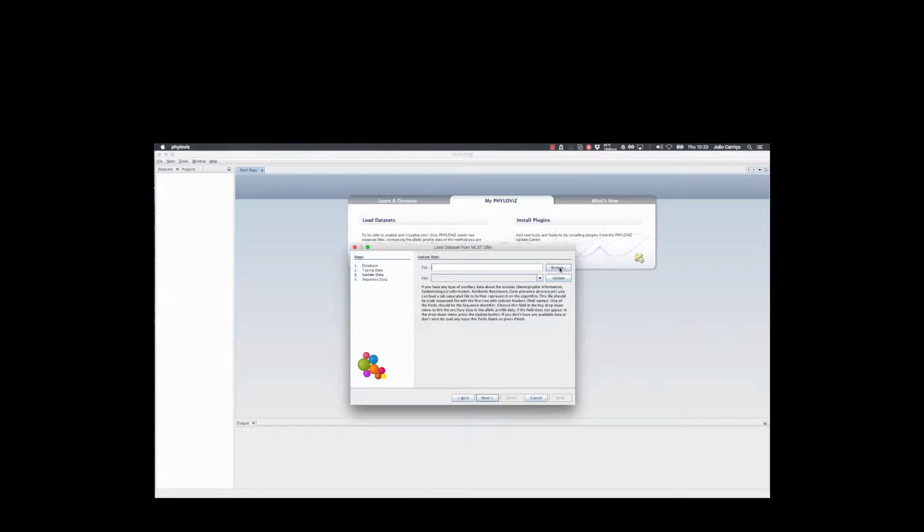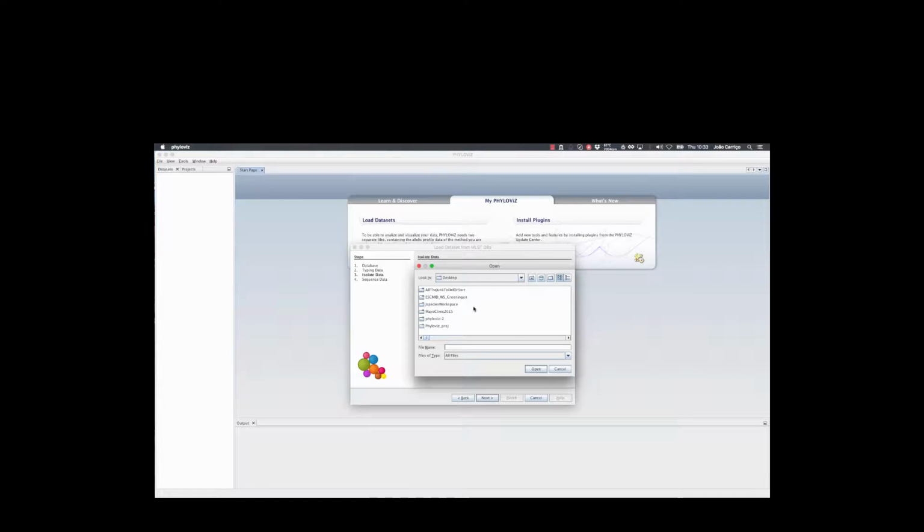Now if you have your own metadata, you can add metadata here. For instance, here I'll add a small subset that includes antimicrobial resistance. The first thing you have to know is you have to connect your metadata to the MLST data through a column that contains the ST. In this case, we'll have country, serotype, penicillin SIR cleaned from the database, and the corresponding genes in the schema as well.